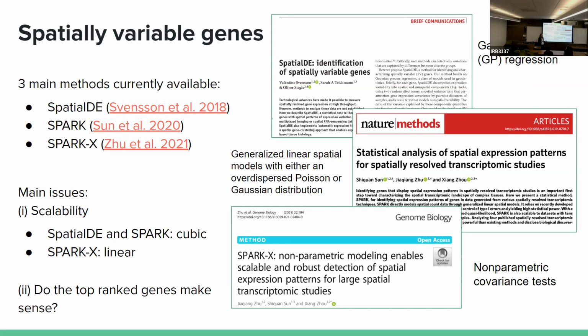So we'll be doing subcellular resolution by the end of this year. So this is totally not feasible to run. You have to wait 30 minutes per gene, essentially, to figure out if that gene is informative. This one is scaled linearly as a function of the spot. So the first two are just horribly slow.